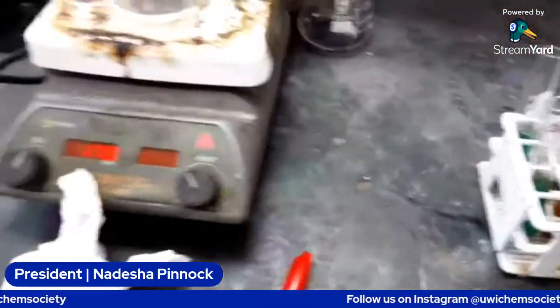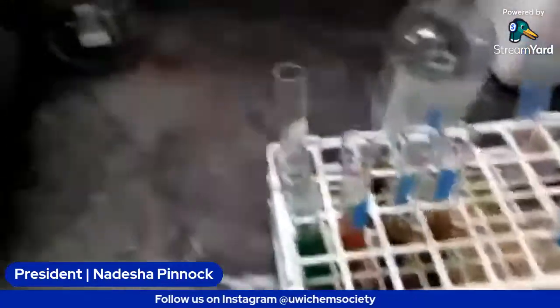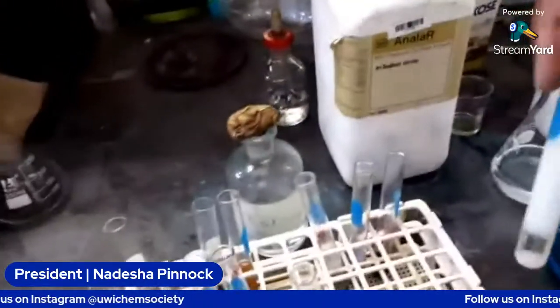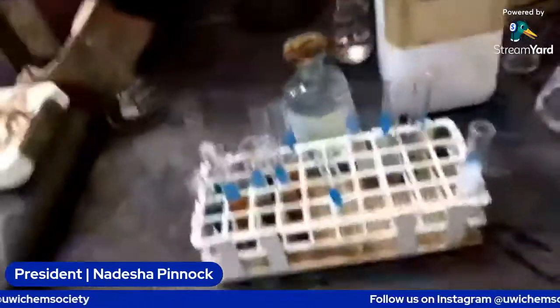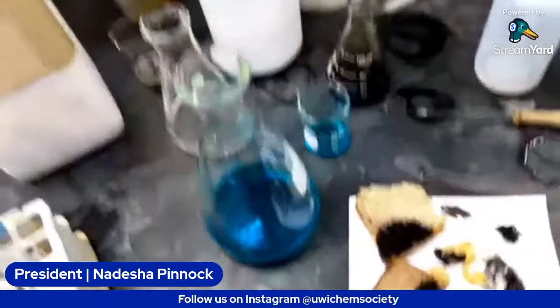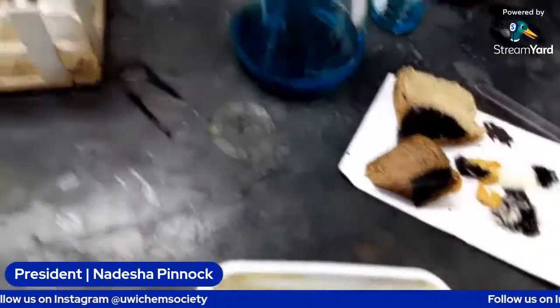And then we did the reducing / non-reducing sugar test. Well, the non-reducing part is what we're going to do now. We had done the fat emulsion test. There is another test for fats that you can do. I'm just going to do it on this paper that I have using some butter.